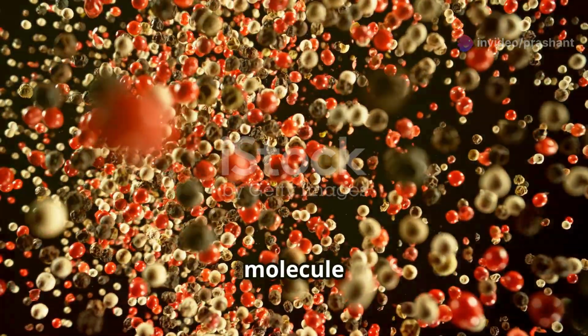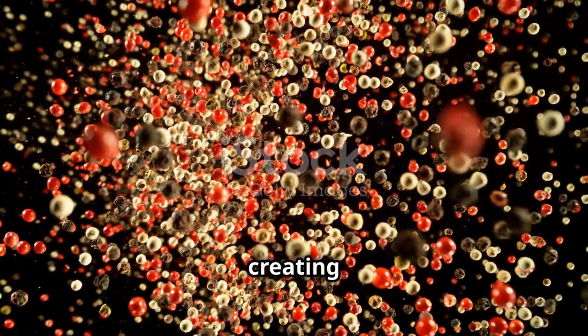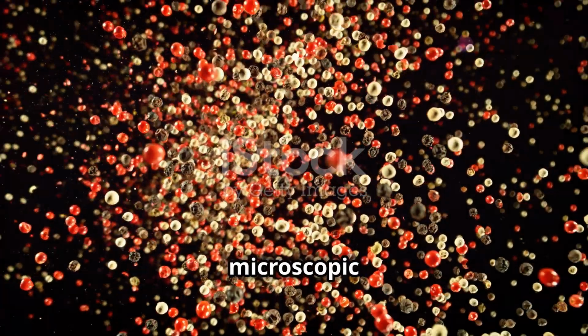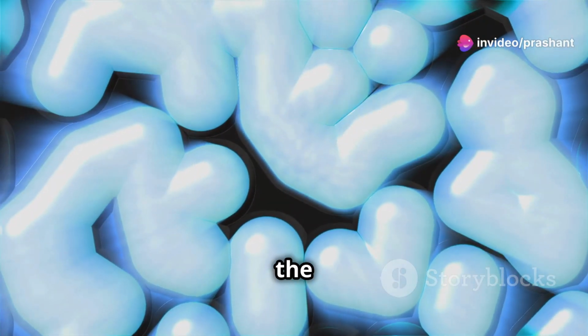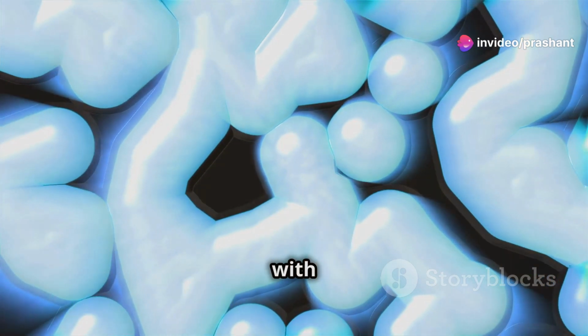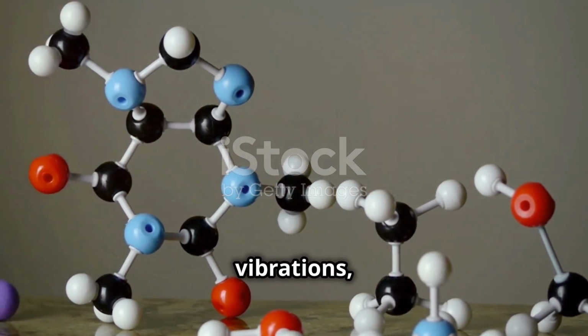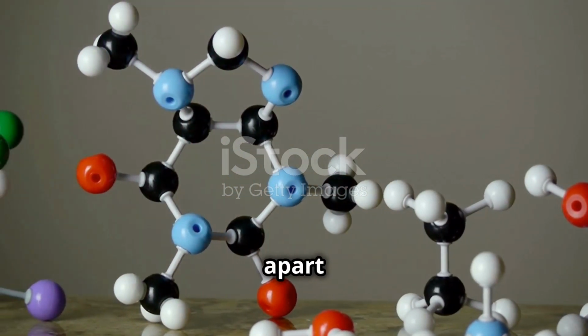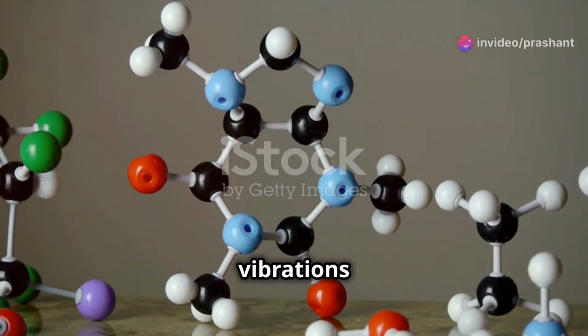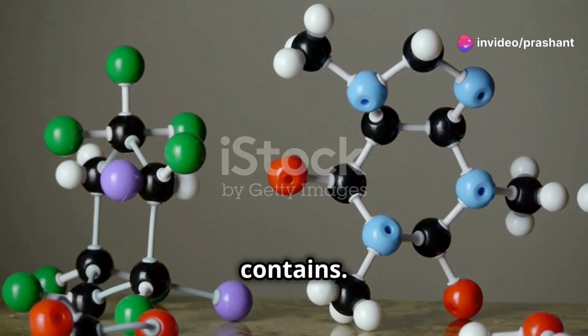Imagine every molecule dancing to its own tune. Each one moves in a unique way, creating a symphony of motion at the microscopic level. That's what's happening at the molecular level. These tiny dancers are constantly in motion, each with its own rhythm and style. Each molecule has a unique set of vibrations, like a fingerprint, that sets it apart from all others. These vibrations are influenced by the molecule's structure and the types of atoms it contains.